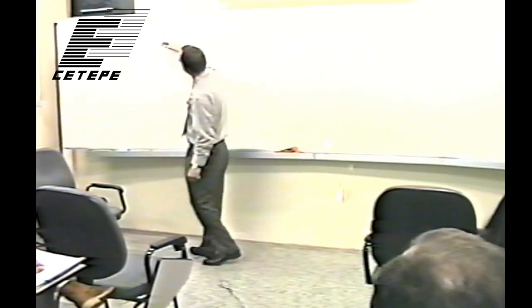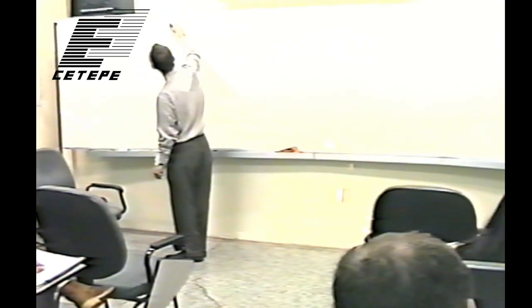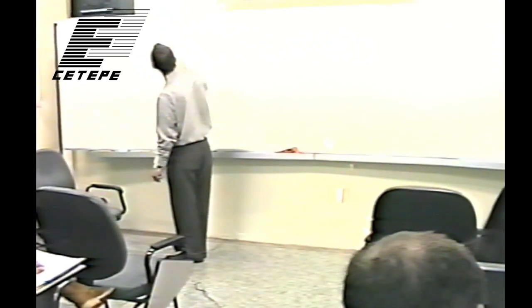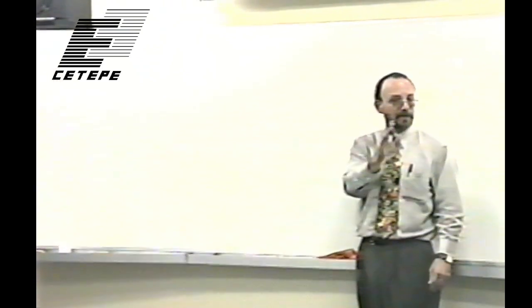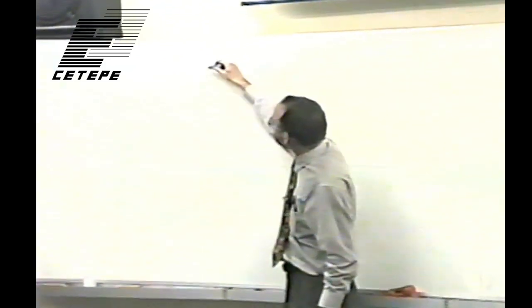And because this plot is usually a logarithmic one, these are very dramatic. As you go from this side of the K-edge to higher energy, just when you hit the K-edge, you can go up an order of magnitude or more in your likelihood of an event or an absorption. So they're very important.